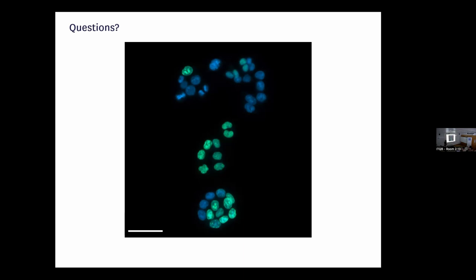Yeah, we tried that for a long time, to have two pairs of FRET, where the acceptor would then be the donor for the next. Yeah, that's right. We tried that. It seems that it could be possible. Now there are wonderful developments in the world of probes. Actually, from the University of Amsterdam, where I was, they are developing new fluorescent probes with huge brightness, very long lifetimes, which can be used to detect a cascade of interactions. It's very hard to detect the second one.